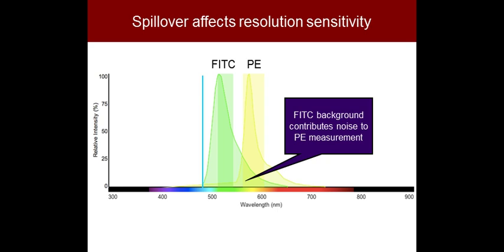All right, so I'm also now here showing in turquoise the 488 nanometer blue laser line, which excites both of these fluorochromes, FITC and PE. And so a little bonus question for all of you is, why is the FITC filter in the green rectangle so narrow when the FITC emission peak, which is the curved green line, is relatively broad?